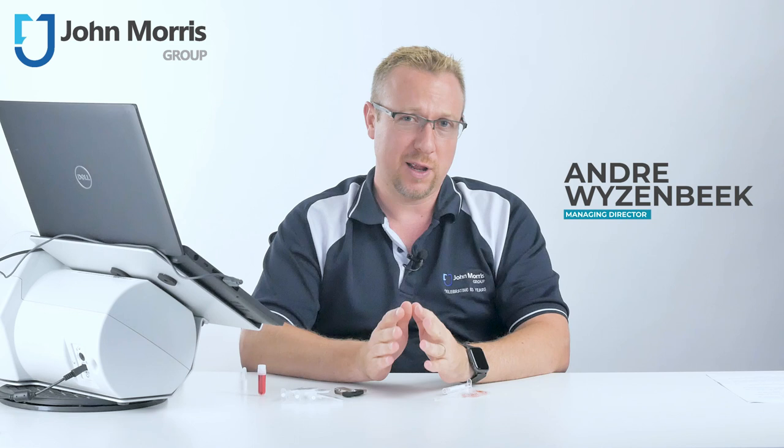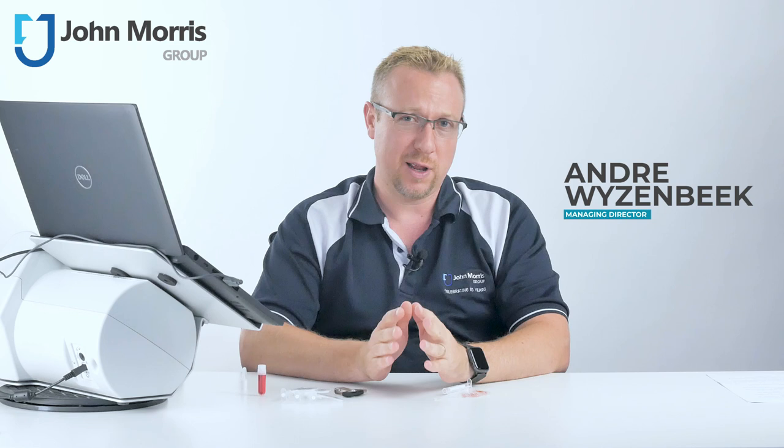Hi, I'm Andre from the John Morris Group and today we're looking at the NC200 from Chemimetic. So what's it all about?